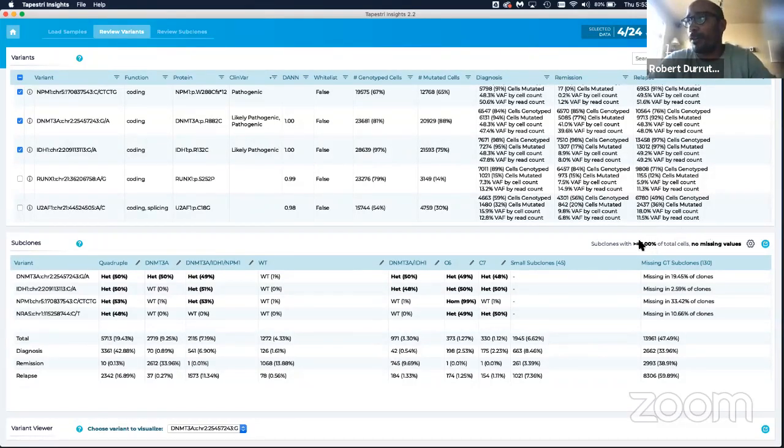And we have this threshold of 1%, which can be changed as well. And so in this case, C6 now, when I interrogate that, it looks identical to my first clone. The only change is really the zygosity state, that NPM1 is called homozygous. Unless I truly believe that this is a homozygous mutant, which is, from an oncology perspective, highly unlikely that both alleles are being impacted, this homozygous call could also be the result of amplification of the mutant allele, where you dilute out your wild type allele and GATK just recognizes the mutant reads.